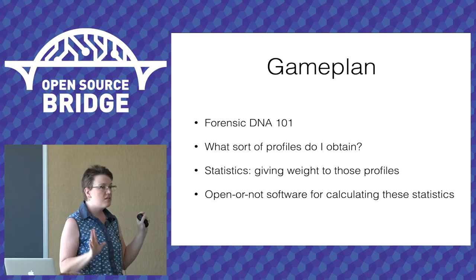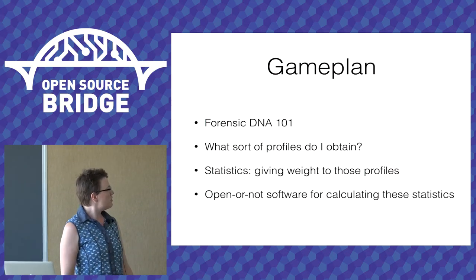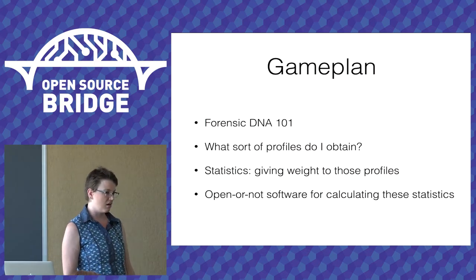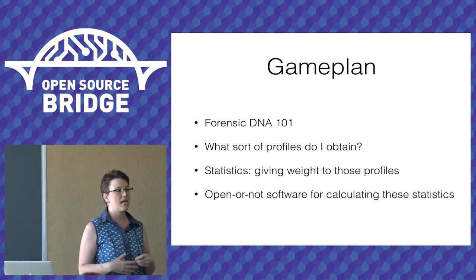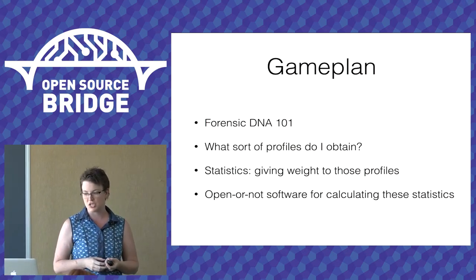I'm going to explain what forensic DNA is. You need no prior knowledge of that. I'll give you some examples of the profiles I obtain, the good ones, the bad ones, and the ugly, ugly ones. And then where the open or not software comes into play is using it to calculate statistics to give weight to these forensic DNA mixtures.